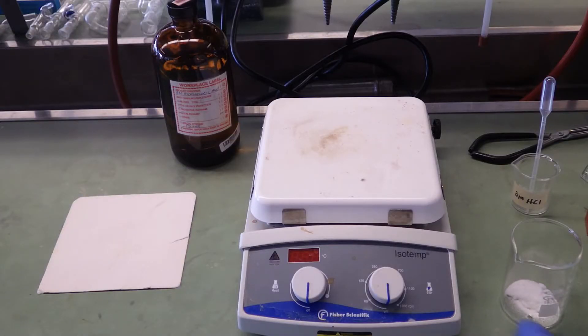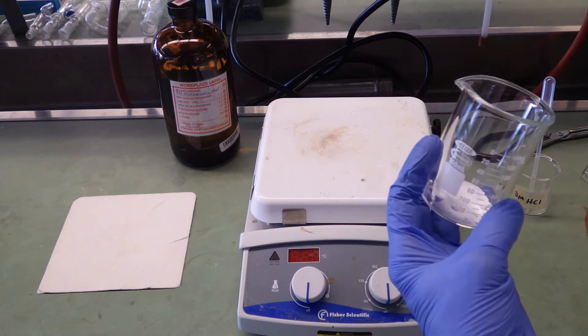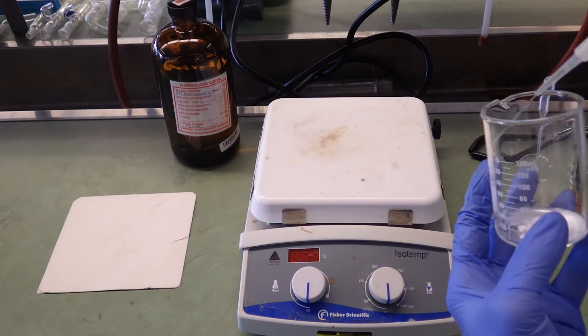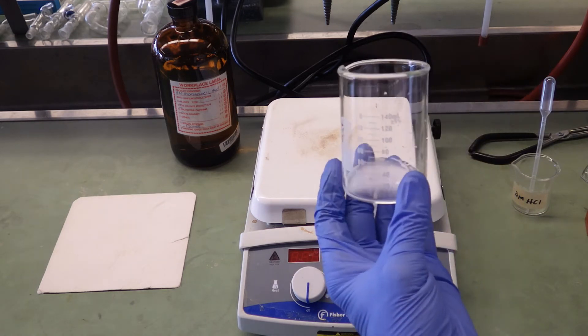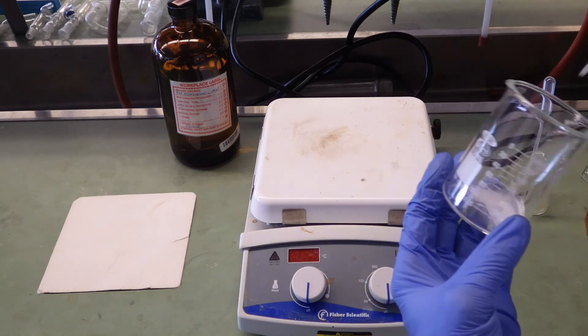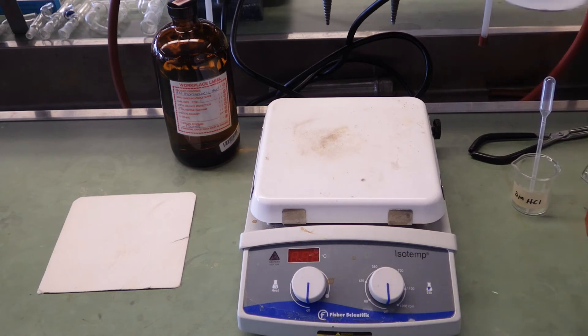I'm going to wet down the sides of the beaker with a stream of distilled water. You don't have to dissolve all the sodium bicarbonate. We'll just have a wet slurry of sodium bicarbonate and water.